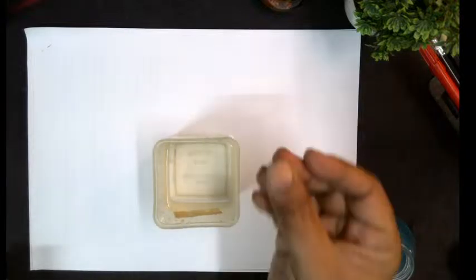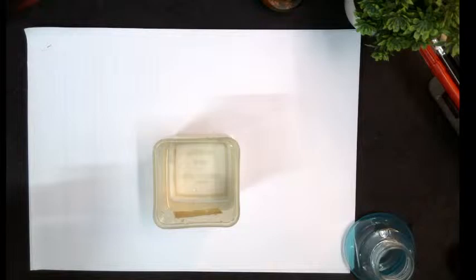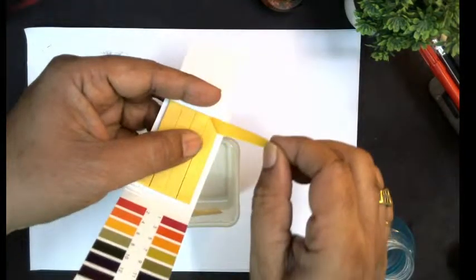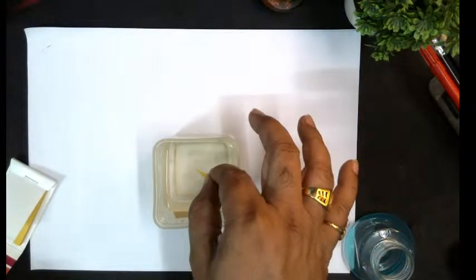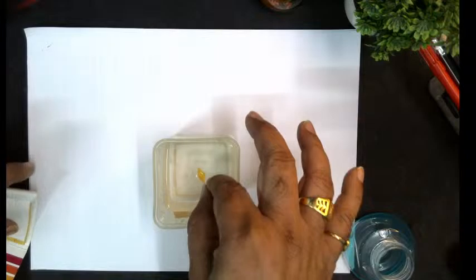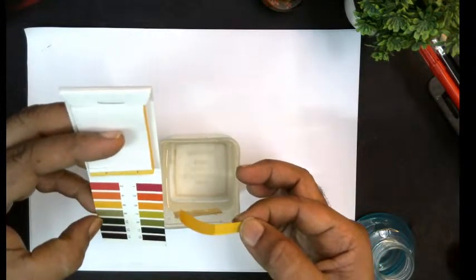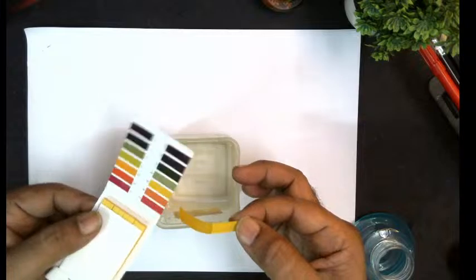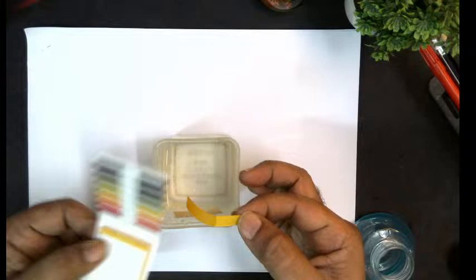Make sure that your hand is free from water or any liquid. Now let me remove one strip and dip it here. Okay, now let us check the pH. So it indicates around 6 here. Being a weak acid, it has gone to pH level 6 from 7.